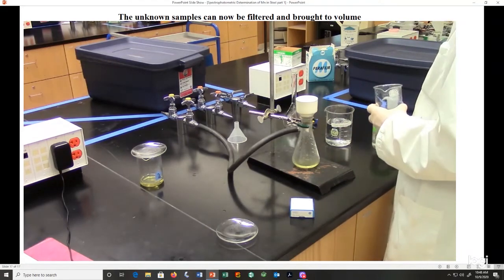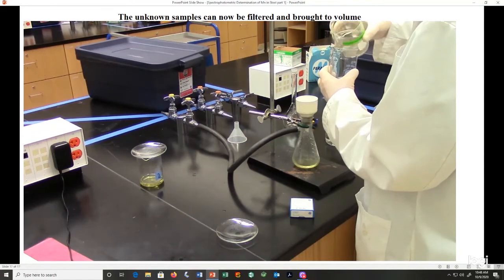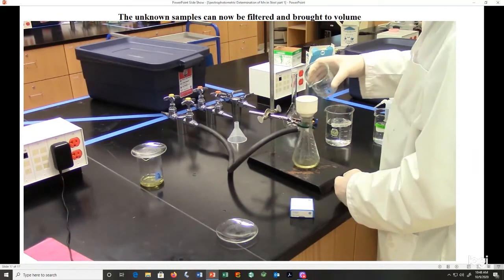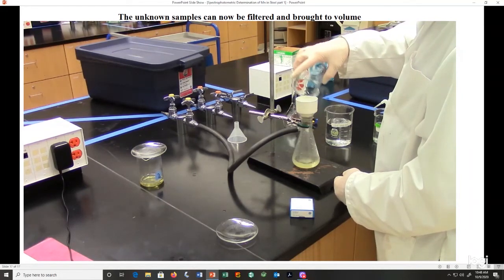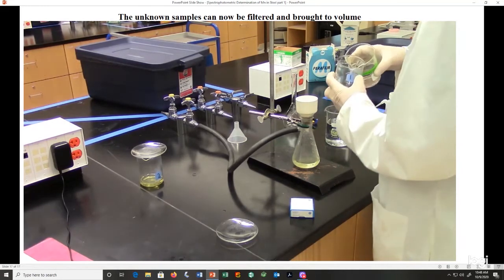So this is where we're going to use our 0.05 molar nitric acid solution to rinse that beaker out. Make sure we make a quantitative transfer. We'll do that a couple of times.